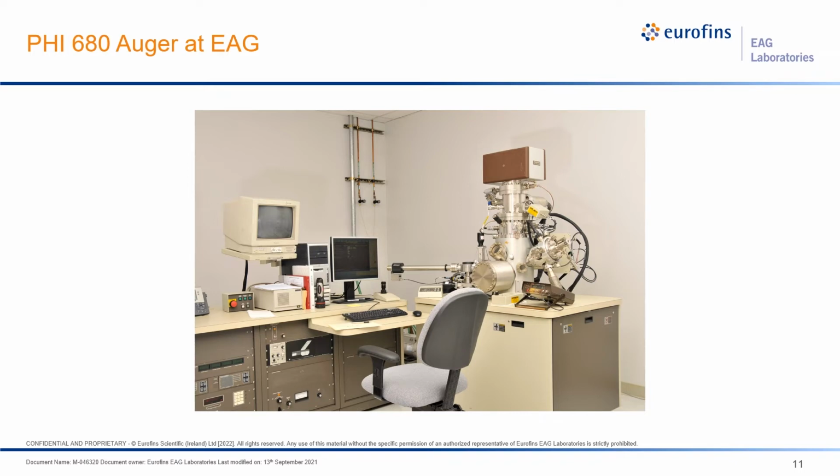So here's one of our Auger instruments. I wanted to show you what one looks like, and I can point out some of the features of this marvel of engineering. At the top, there's a brown box-looking contraption. This is actually an ion pump that's dedicated solely to maintaining UHV conditions around the source. Our primary beam is a field emitter, and these emitters are very sensitive to surface contamination, so it's imperative that it stays clean for the entire lifetime of the tip.